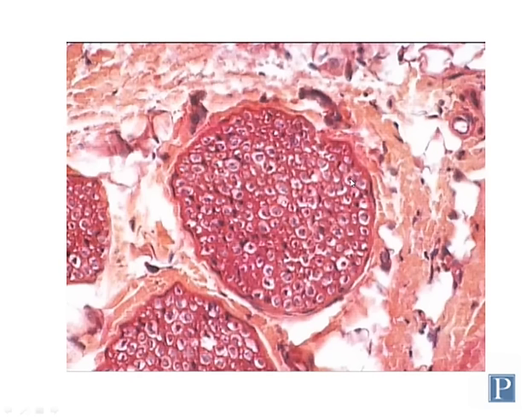So here you have the axons in the center that appear to be surrounded by the white spaces, which used to contain myelin. In between the axons, outside of where the myelin would be, you can see this eosinophilic connective tissue. This is the Endoneurium, and it's a type of loose connective tissue, not dense irregular connective tissue. So make sure you know those three layers of connective tissue that's found in nerves, in the peripheral nervous system.